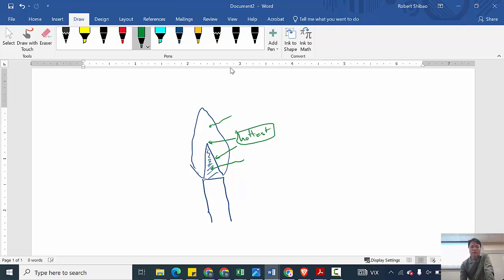Where would be the coolest part of the flame? Hottest, is that right? Yeah. The outside, actually the outside is not the coolest. Yeah, the inside. This is just the gas. The gas hasn't been ignited yet. The gas ignites right at the surface here. So inside, this is unburnt gases in here. And so it's not that hot. And then the medium part of the flame would be outside. This is for the temp.